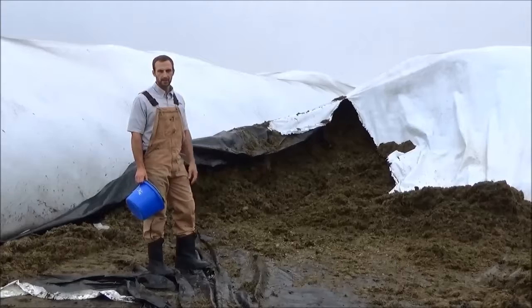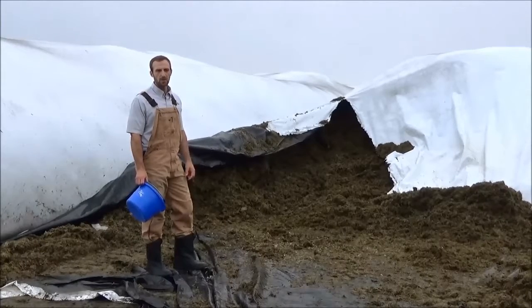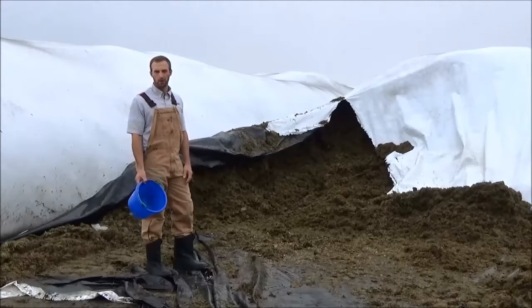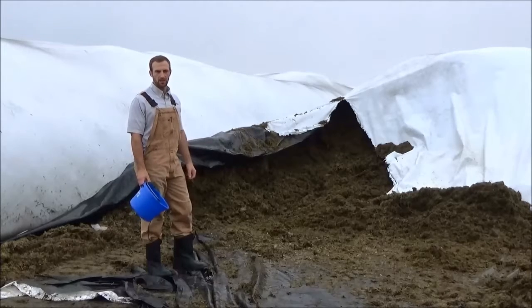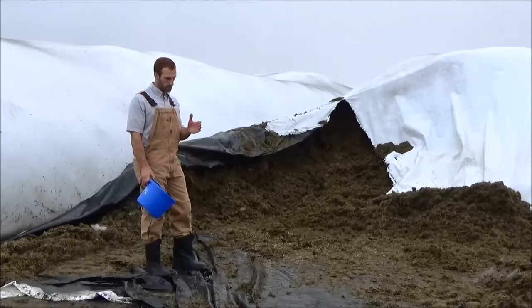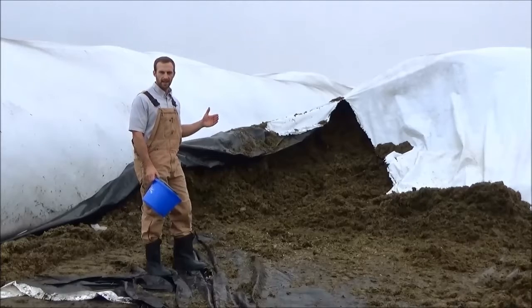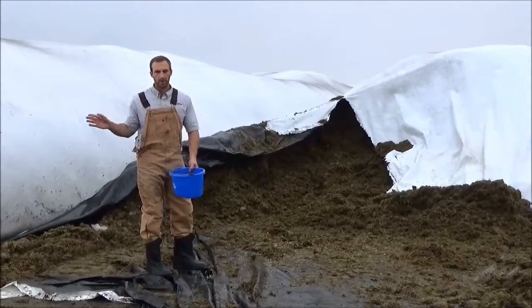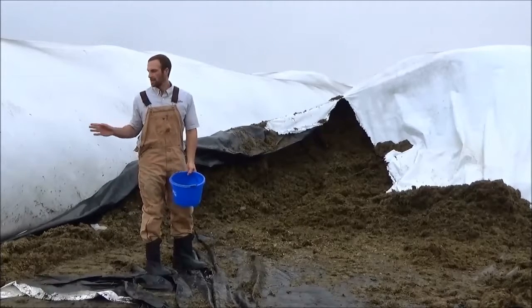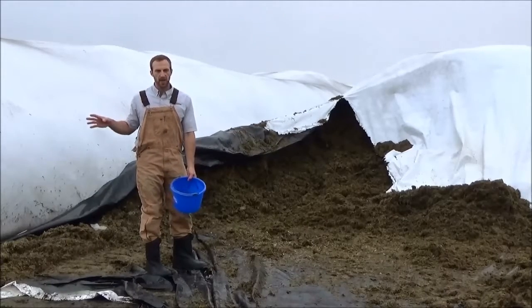We're going to work through sampling a bag silo, which can be a little bit more difficult than working with a bunker, a pile, or even a traditional upright where typically enough face is defaced or brought out through the day. With bags we move through so much depth in a day it can be pretty difficult to adequately sample. I'm not going to advise going along the bag and coring in — we don't want to compromise the anaerobic nature of the bag.